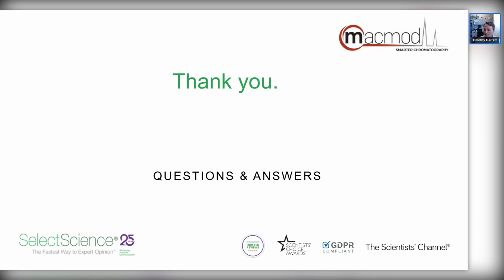Yeah, good question. 1 ppm is achievable, but we typically use a 5 ppm tolerance to search, just to give a little bit of leeway if for some reason one scan in all of your mass scans falls out of that 1 ppm mass accuracy. And so it's usually 5 ppm as a search.